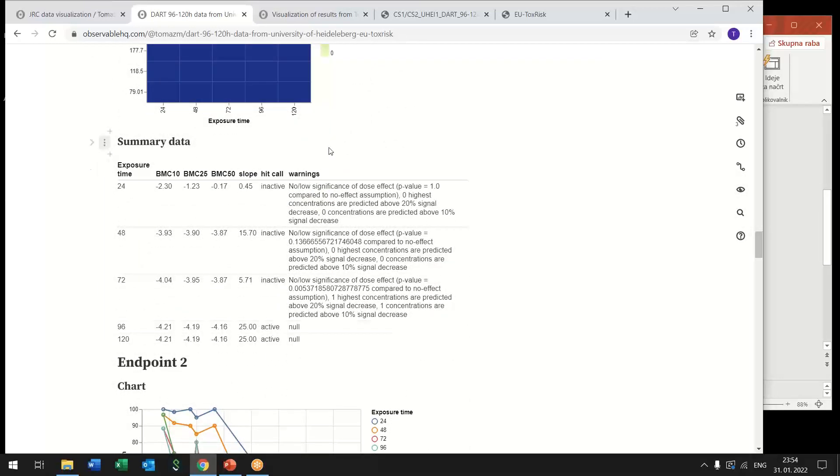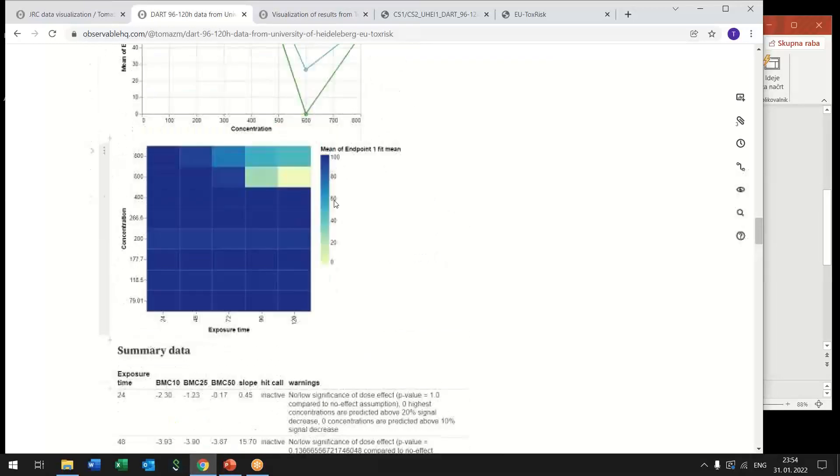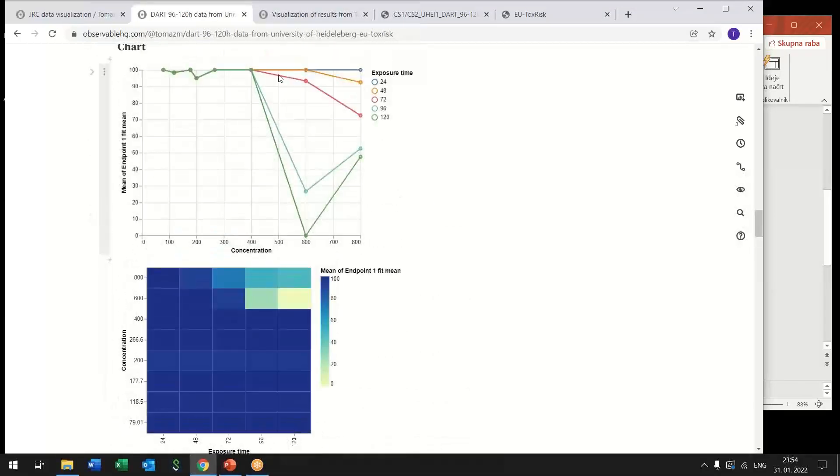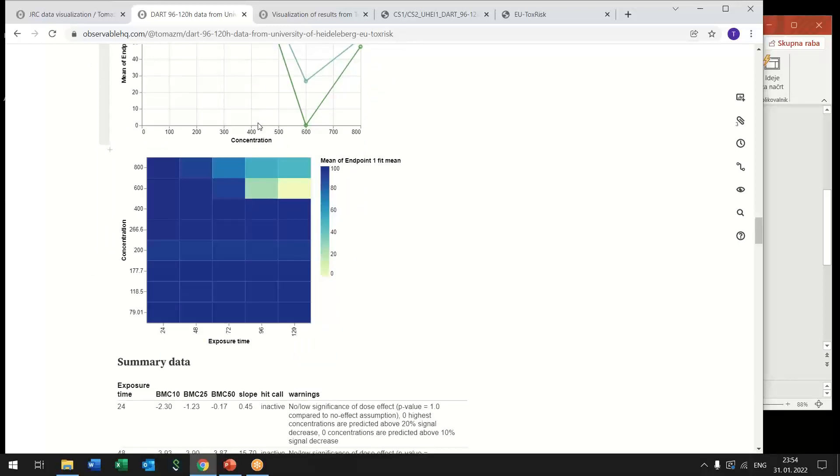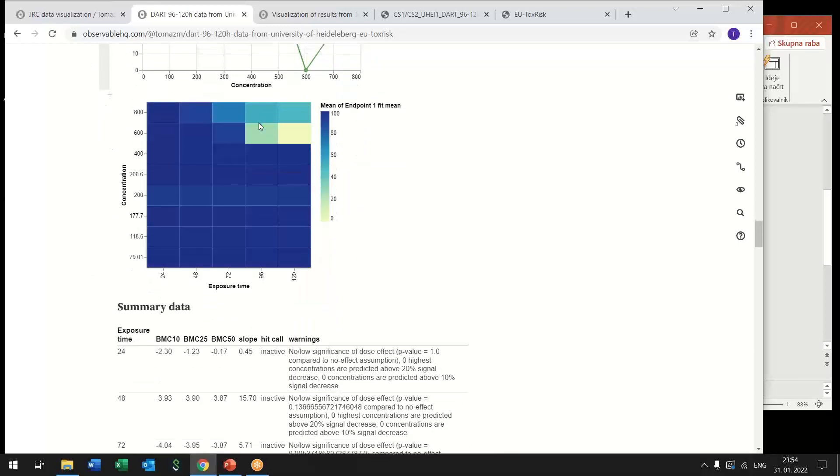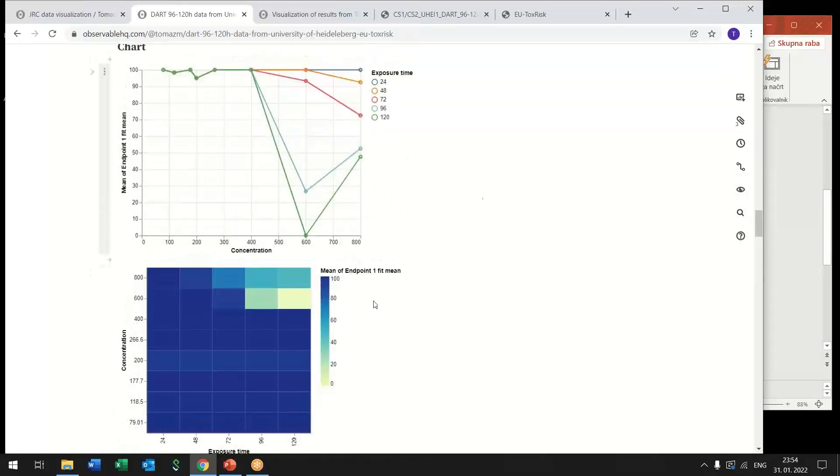Also this data was so here what we see here is a visualization of raw data but what we are interested in the end are benchmark concentrations for example and all this raw data was processed and also the processed and summary data sets were published to the database.